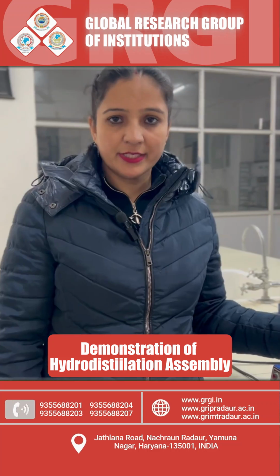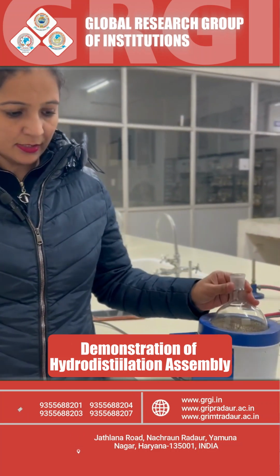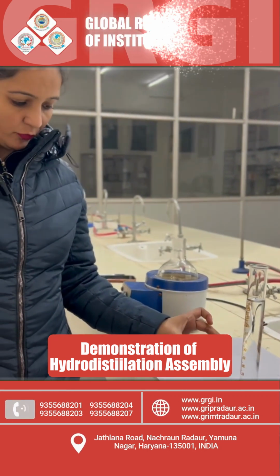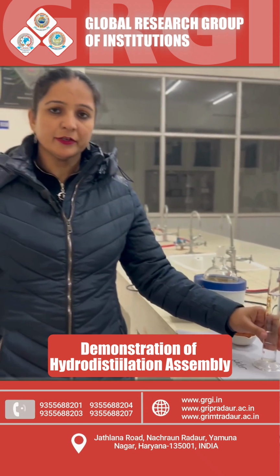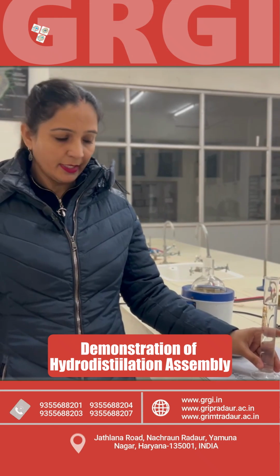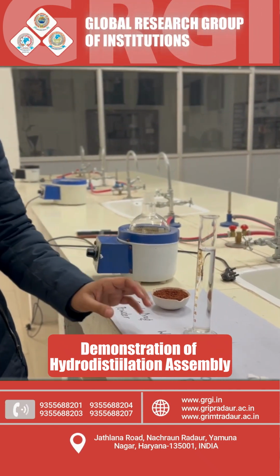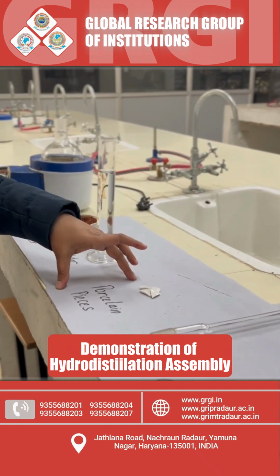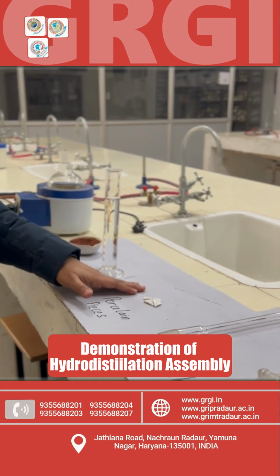Different parts of a hydrodistillation assembly include a heating mantle, round bottom flask, crude drug powder from which we have to isolate our volatile oil, and water. We need to remember that in this assembly water is not used as a solvent. It is used as a heating medium. It will not dissolve the volatile oil. Next part is porcelain pieces. A minimum of 3 to 5 porcelain pieces are required.